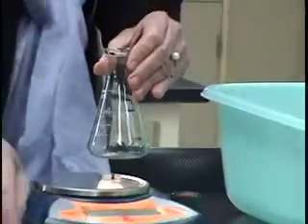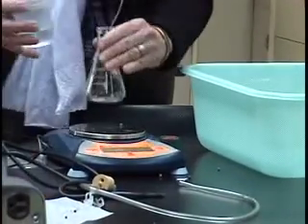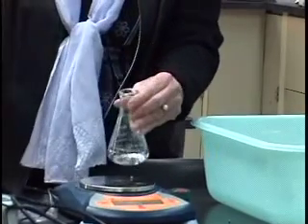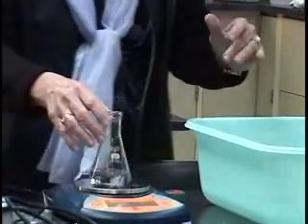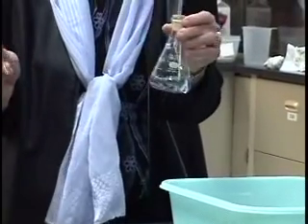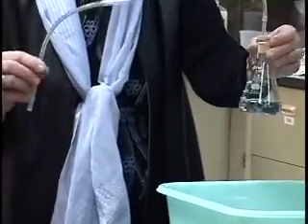and put them in an Erlenmeyer flask with 100 milliliters of hydrogen peroxide. You can use an Erlenmeyer flask, or you could simply use a small soda bottle for this. It doesn't have to be an Erlenmeyer flask.